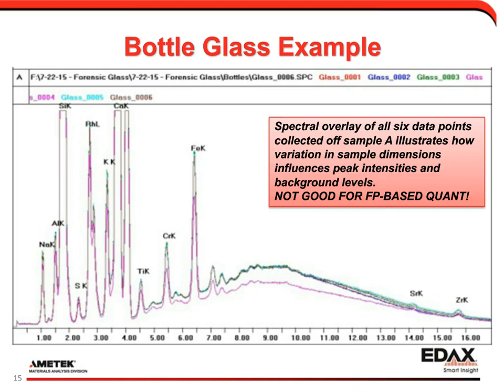But when they're relatively close and still a bit ambiguous, as in this case, you would then want to do the quantitative routine for these samples. So obviously not good for FP-based quant. These samples would probably not give you a consistent or reliable answer as to whether they are of the same composition or not.